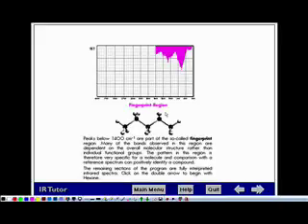Basically, if there was a carbonyl, it would be nylon. If there's no carbonyl, polyethylene. Plus, I took a Ziploc baggie, which is polyethylene, and compared it, and it was fine. So it's not full of lead. Well, it has some lead in it, but nothing to be concerned about. The 1-inch gap at the midfield, that's huge, and all the black tarry stuff, I'd be more concerned about that than the actual field itself.